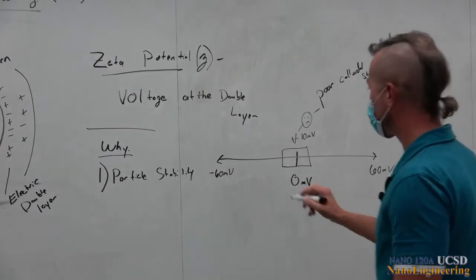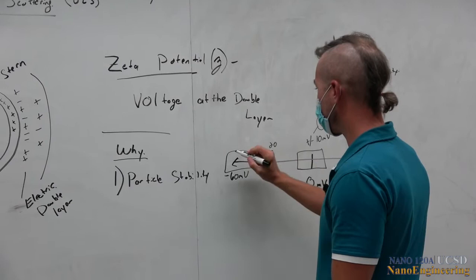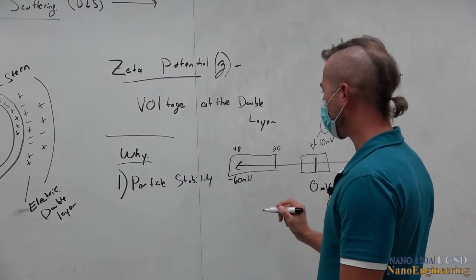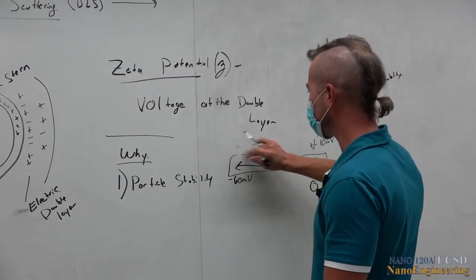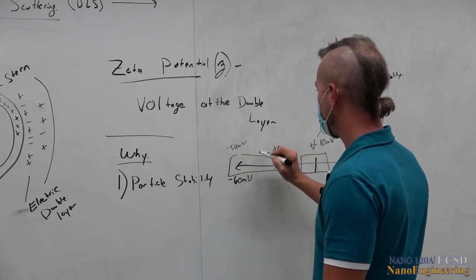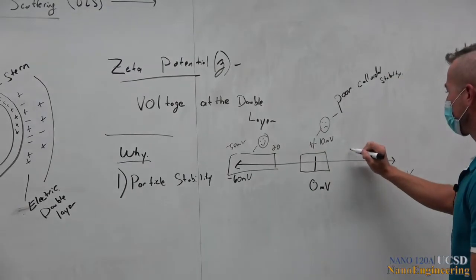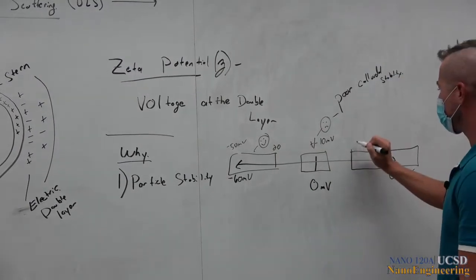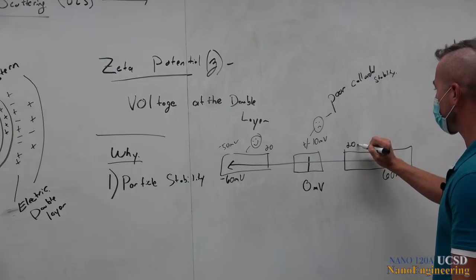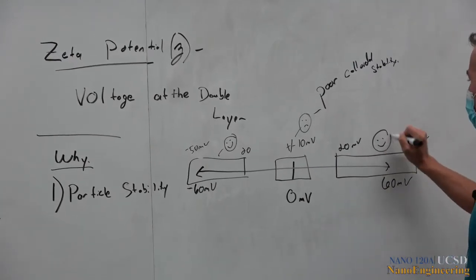But if we get out here, maybe 20 or so, I don't think I've ever measured anything that's more than 50. I guess it exists. This is good, smiley face. A good range here, say, let's call it 20 millivolts to 50 millivolts, smiley face.